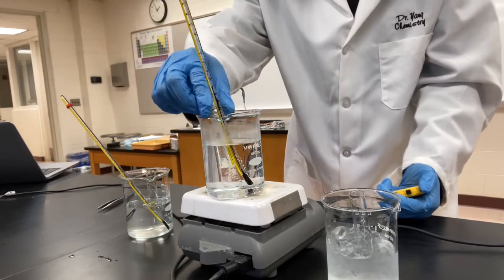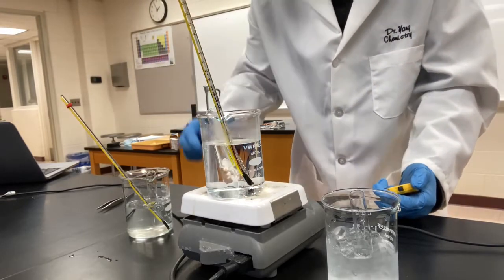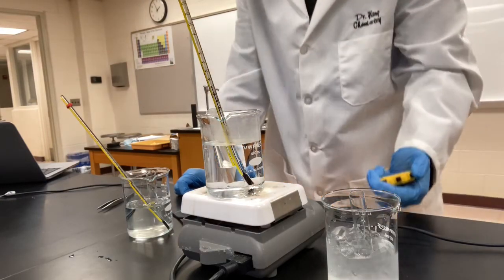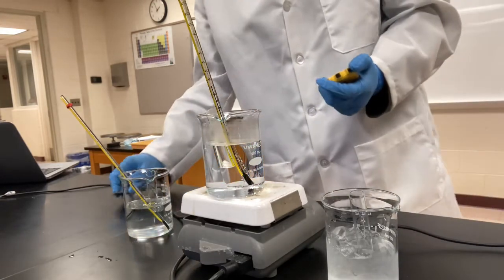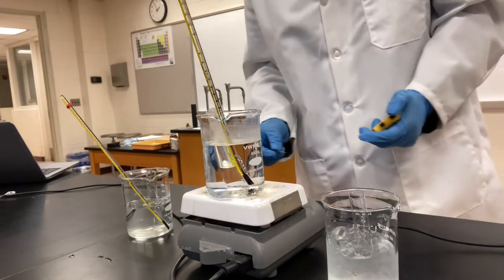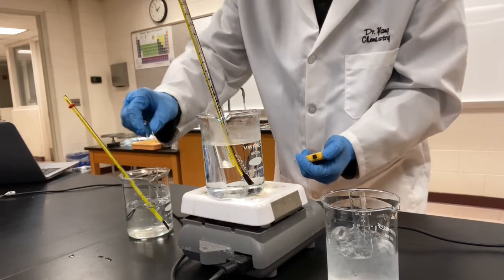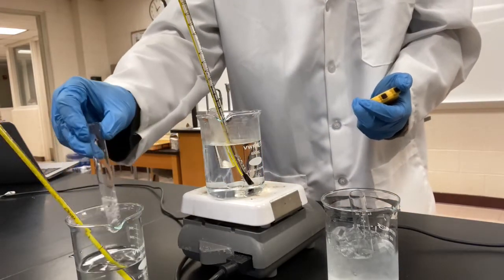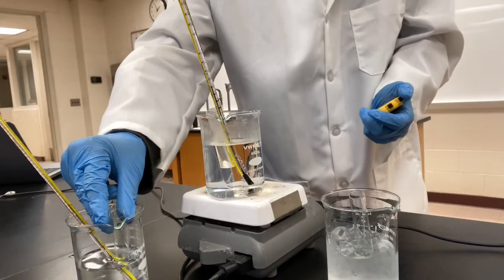All right. All done. 38 seconds. Now let's look at the 20 degrees Celsius. The first one, 38 seconds. A little slower. A lot slower actually.